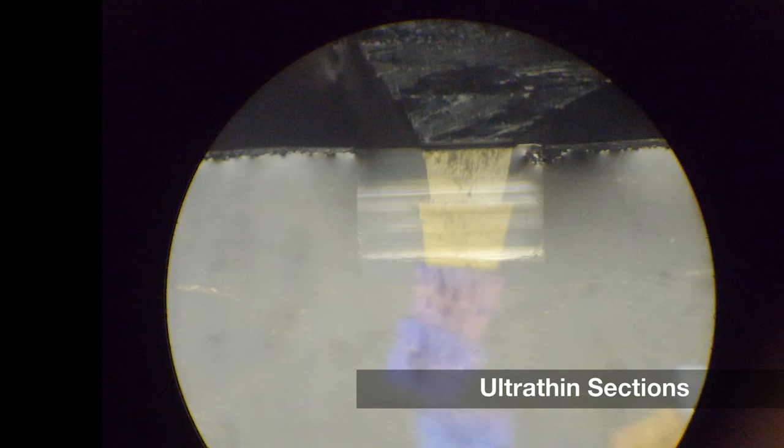The different colors of the sections result from interference between the rays of light reflected off the upper and lower surfaces of the sections. Colors vary according to thickness.